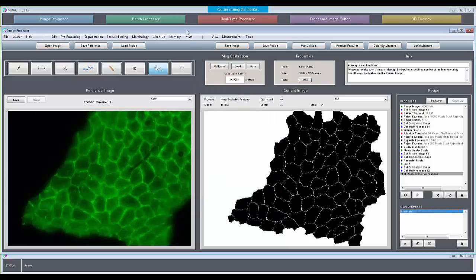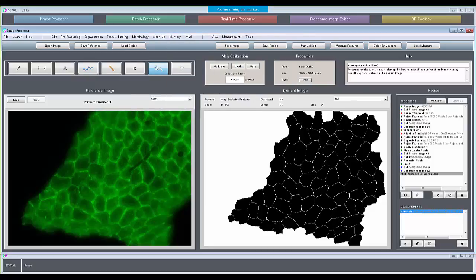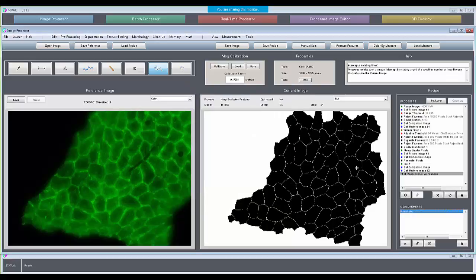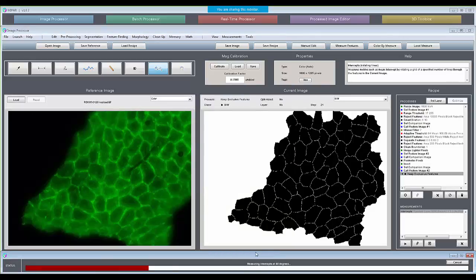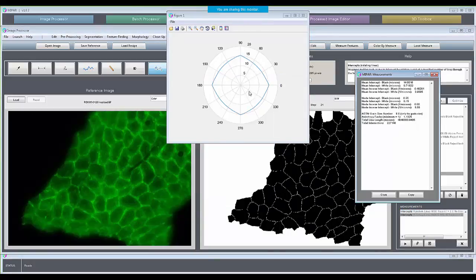That's why we have the grid of rotating lines that puts the same lines down every time. If you ran 1,000 rotating lines that are spaced evenly, starting from 0 degrees, so running horizontal, that then rotate through 180 degrees in increments of 10, that's running a grid of parallel lines and then rotating that grid from perfectly horizontal to the other horizontal. So they start at 0 and they come all the way around to 180.